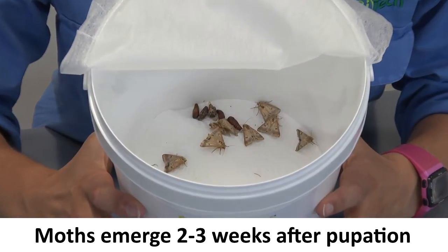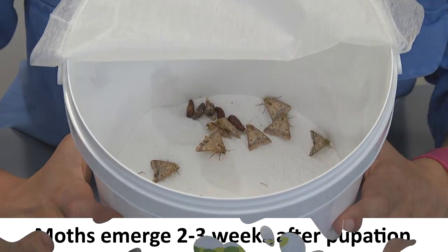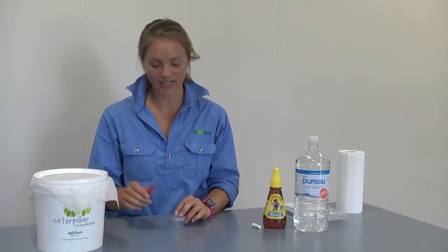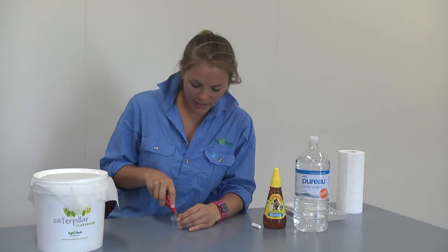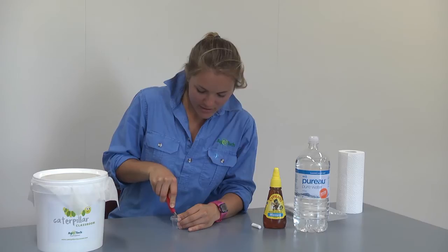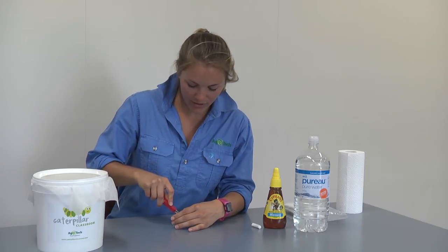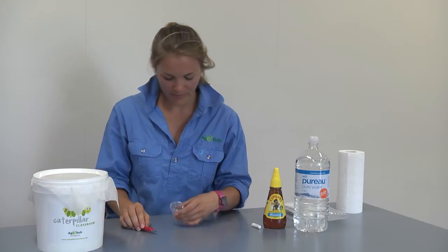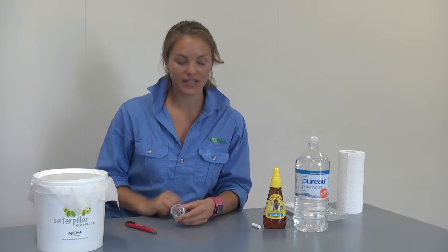Now that your moths have emerged, they will need something to feed on. Take an empty rearing cup and lid, and use a Stanley knife to cut two slits in a cross shape in the top of the lid.